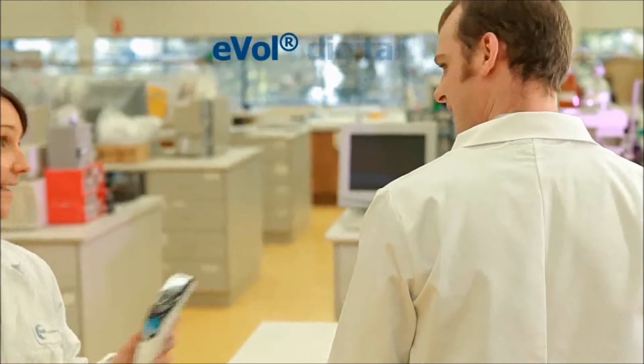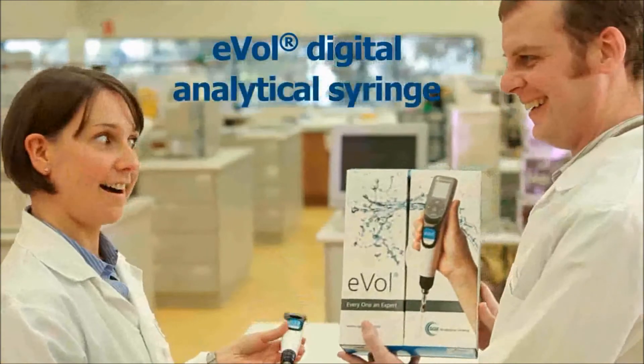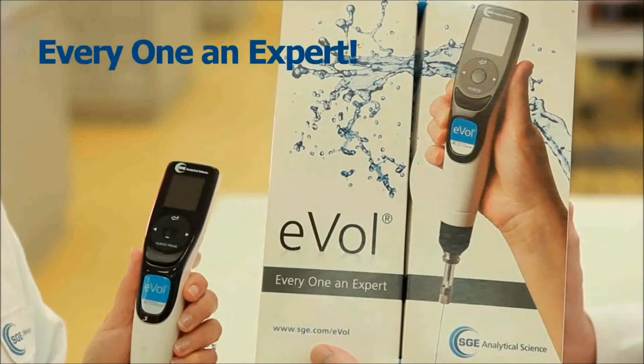The EVOL Digital Analytical Syringe, making everyone an expert in fluid handling.